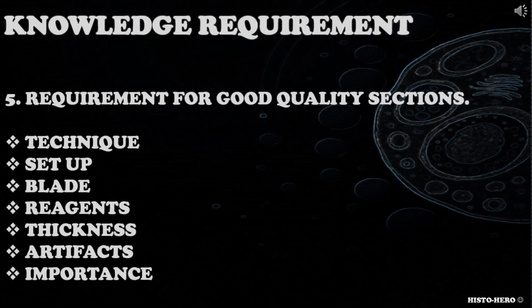The fifth knowledge requirement is requirement for good quality sections. Candidate needs to have the knowledge and understanding about the requirements of good quality section. You could ask the candidate to explain, why is good quality section important? What are the requirements for a good quality section? What techniques to use to obtain good section? What solutions can be used to help them get a good quality section for difficult blocks?